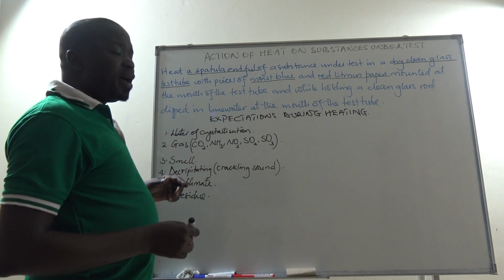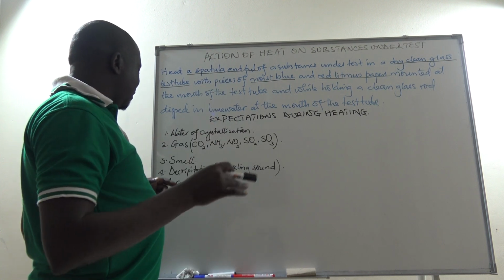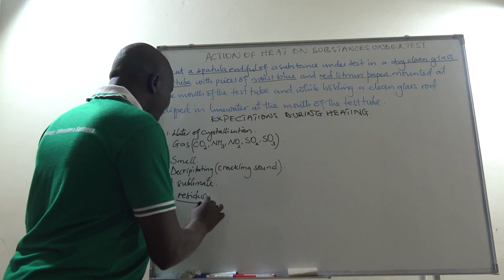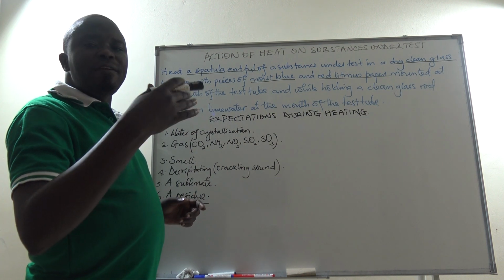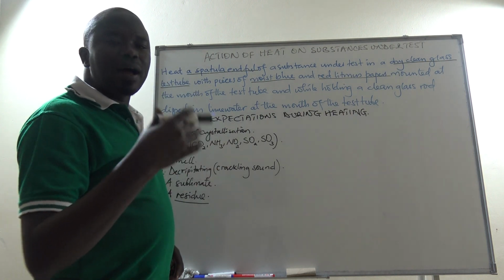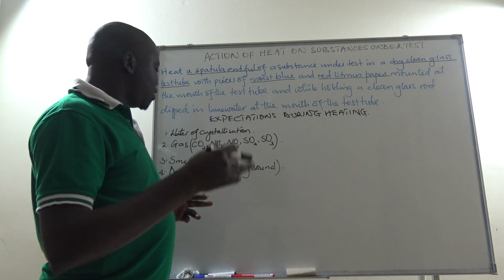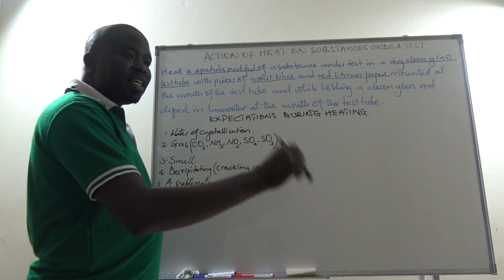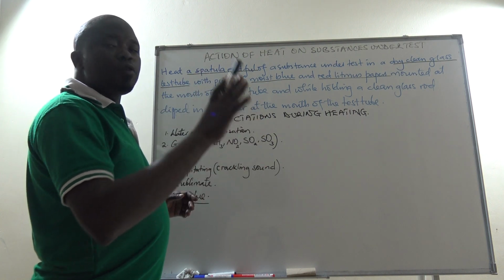Please don't ignore. Don't go and heat just for granted, heat and then leave. It's not the case. With the residue, you have to be very careful, in that the residue has to be taken note of when it is still hot, and even after some time when it cools down, because some residues have particular colors when they are still hot, and on cooling down they change to other colors. So we need to take note of them. Therefore, don't just heat and then discard the residue. Firstly, let it cool down in a safe place.